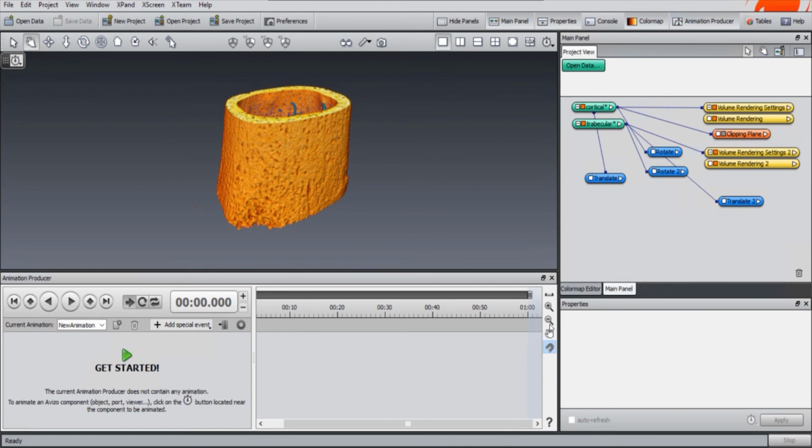Remember that you have 1 minute here, and you can always decrease this or increase the time. So make sure if you finish your project around, for example, 40 seconds, make sure that you drop this one to 40 seconds so that you don't have a video with 1 minute that is not happening anything in the end.